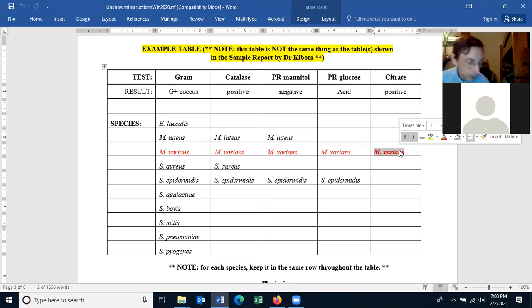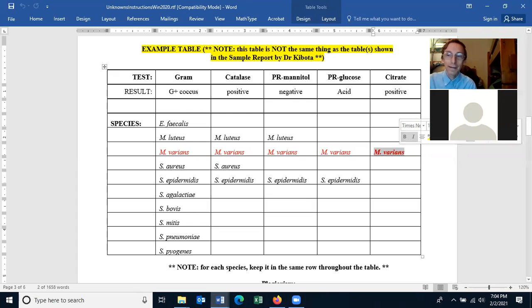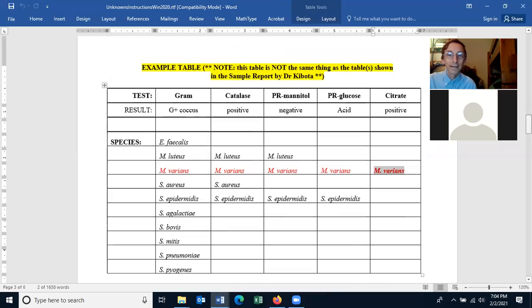What happens if you do more than one confirmation test after you've identified your unknown? Come on, somebody can guess. All right, somebody will have to do it because nobody's guessing. I would guess we will get extra points. No, you won't get extra points. You'll get penalized if you do more than one confirmation test. Oh, come on.